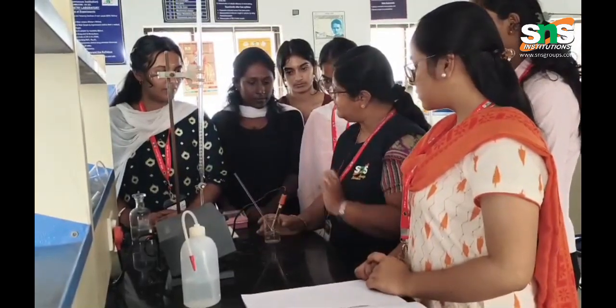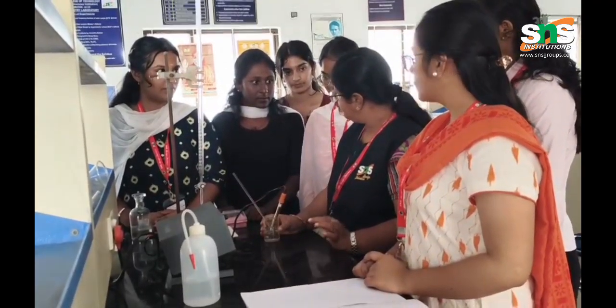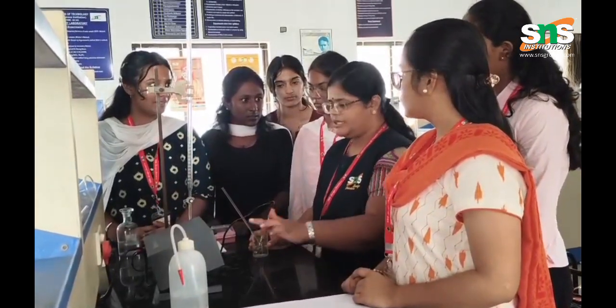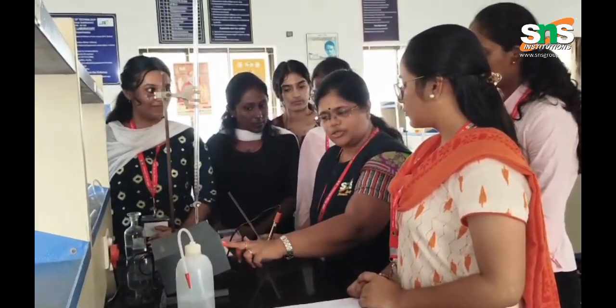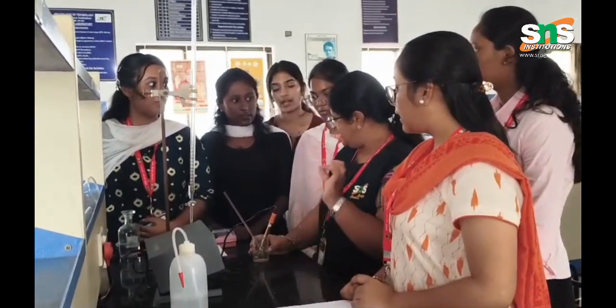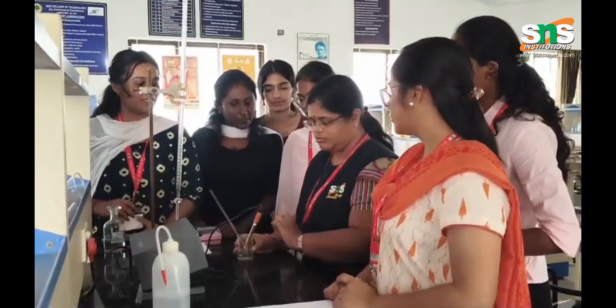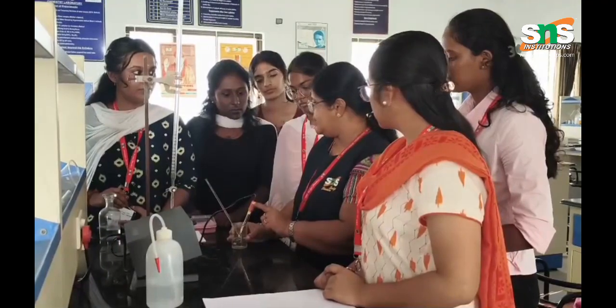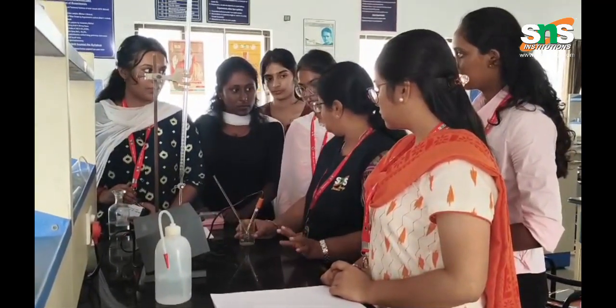Why do we get a value here? You get the value due to the movement of H plus ions in this solution. Because of that, the conductivity cell gives you the value.